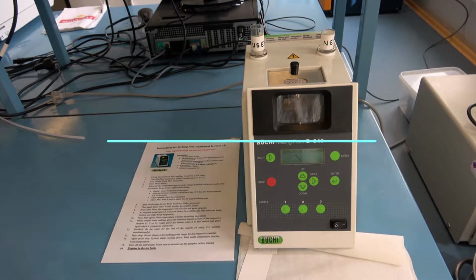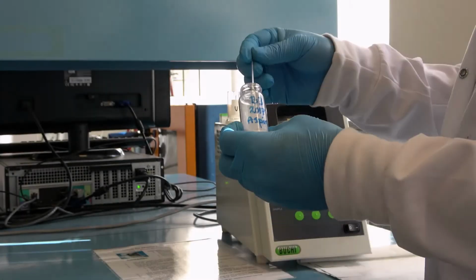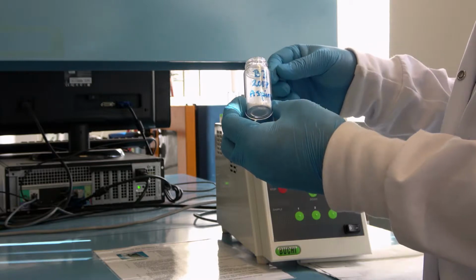Melting point analysis is an important tool when it comes to chemical analysis, as a compound's melting point is a physical characteristic of it and can be used for an analysis as well as estimating the purity.